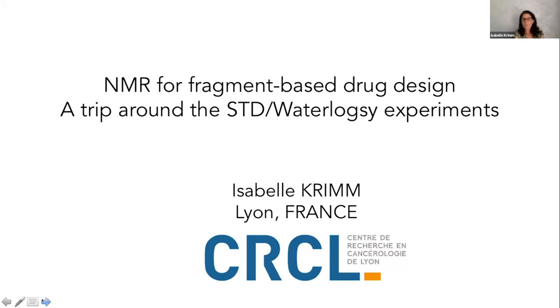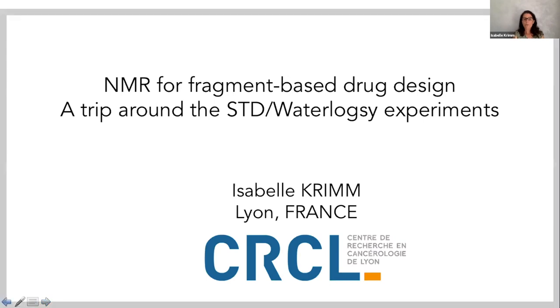I decided to focus on the use of 1D proton NMR experiments like the saturation transfer difference and the WaterLOGSY experiments. But I also want to mention that I use a lot of NOESY experiments, such as the so-called INPHARMA and interligand NOE experiments, and I really consider they are very beautiful experiments to do drug design. But today I'm going to really focus on STD and WaterLOGSY.